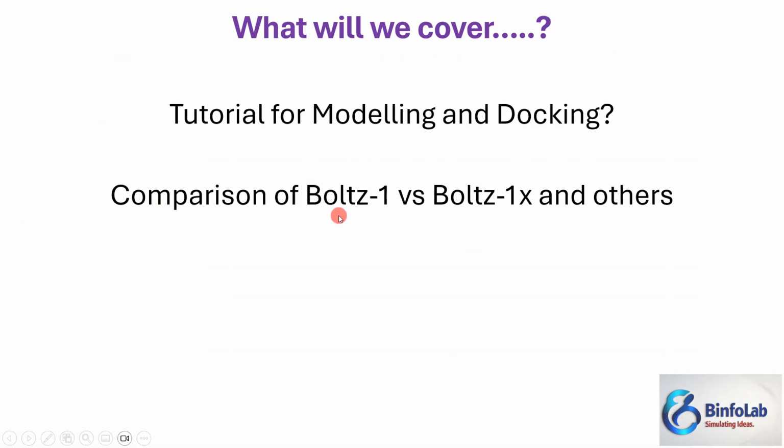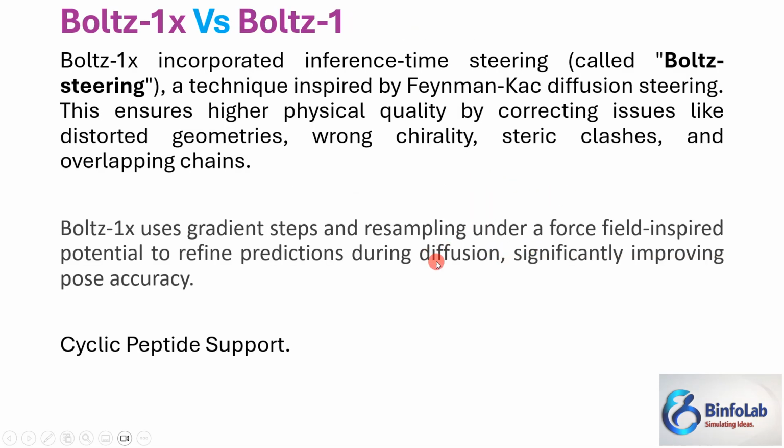What is the difference between Boltz-1 and Boltz-1x and other programs? So remember, in Boltz-1x, they have incorporated inference time steering. That is also called Boltz steering. What actually is Boltz steering? Boltz steering is inspired from the Feynman-Kac diffusion steering.